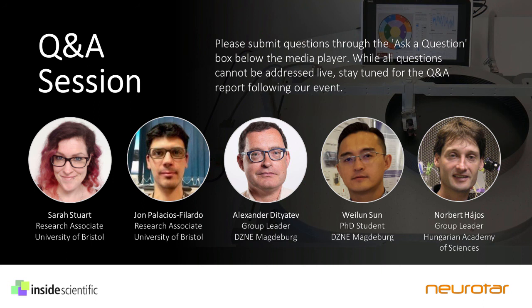But in a lot of the tasks that I've been running, I tend to follow similar training protocols as those that have been used in the virtual reality systems. And I've found that in some cases they learn in fewer sessions by comparison. I think a key factor with that is that in the mobile home cage, the mice are able to rely both on the tactile as well as the visual cues in their environment.